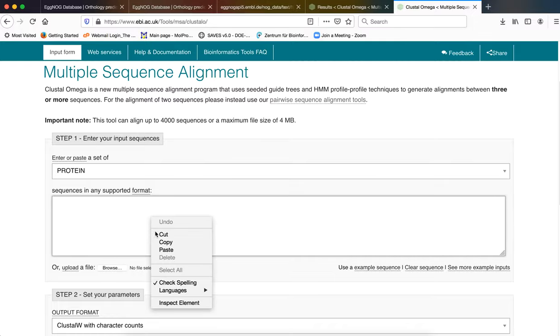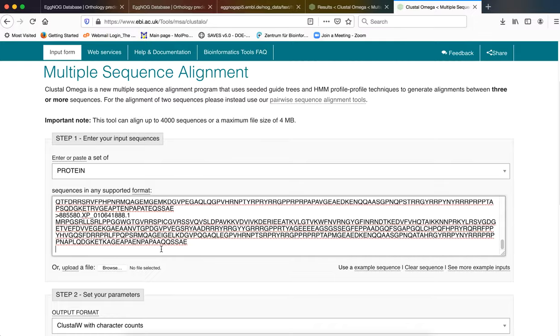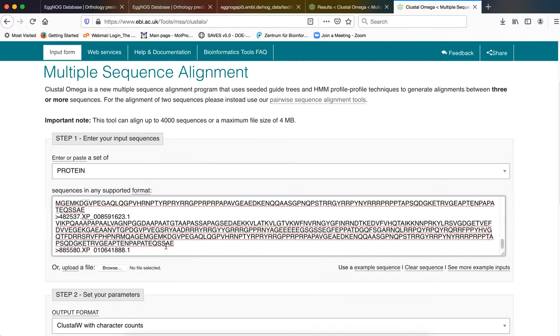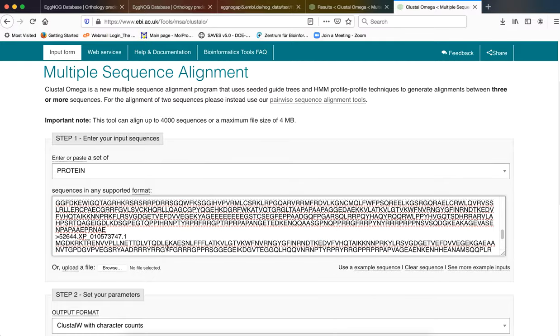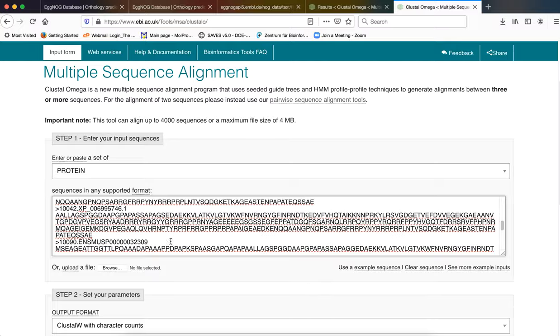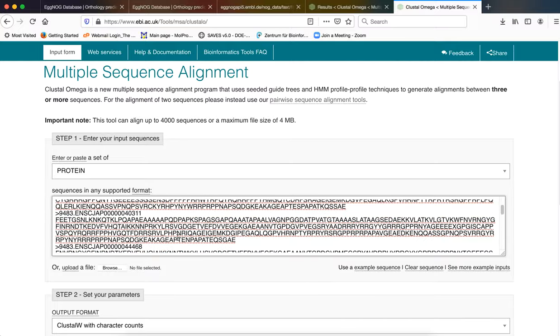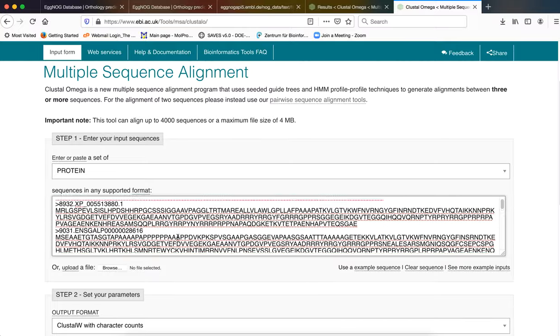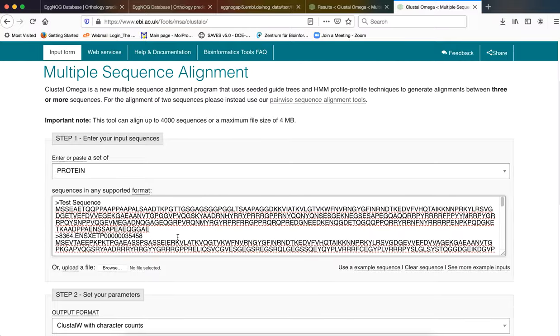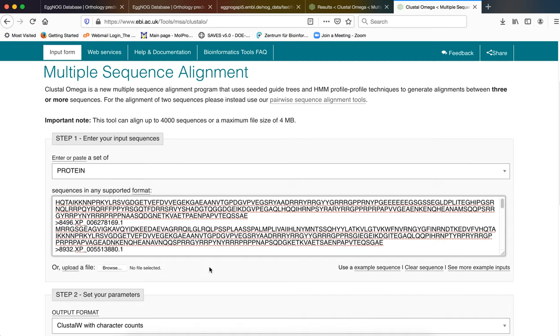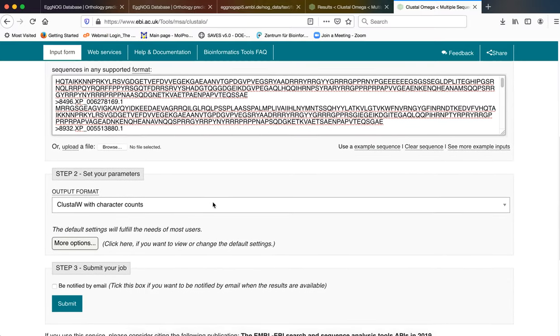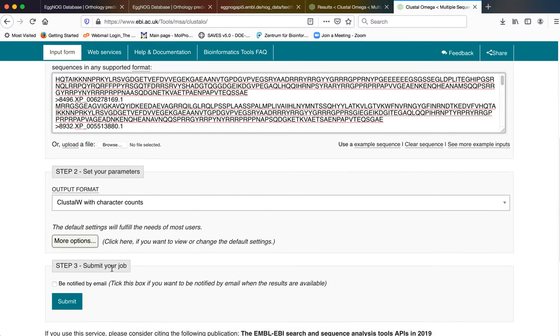We will paste our sequences here. As you can see all the sequences that were contained in the text file is now provided here. Our test sequence also finds its place in this particular segment. We will keep all the default parameters unchanged and we will click on submit.